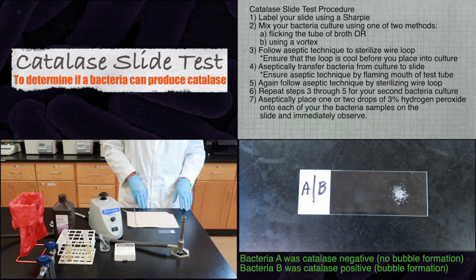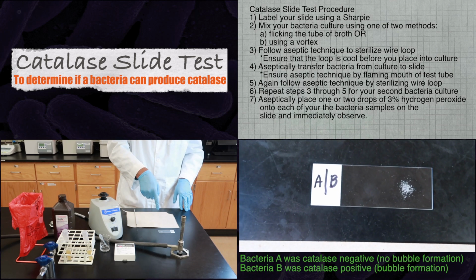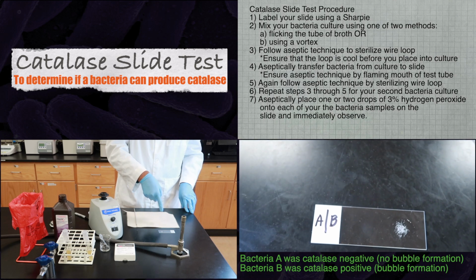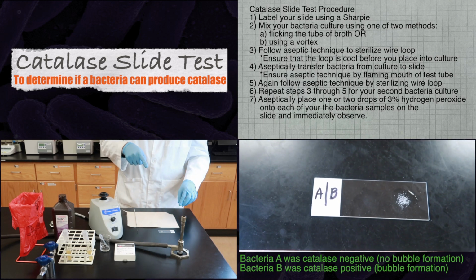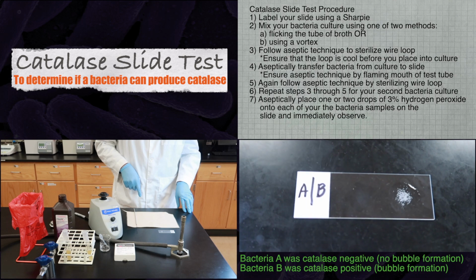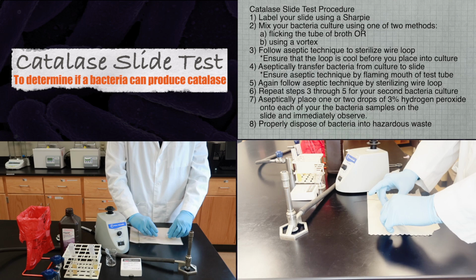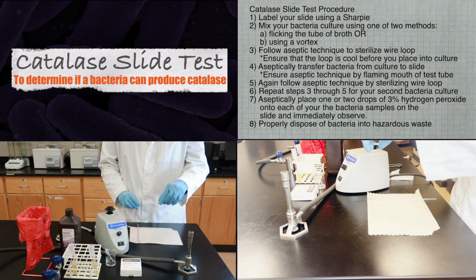In this example, bacteria A on the left was catalase negative because there was no bubble formation, while bacteria B on the right was catalase positive, which you note through the bubble formation. Finally, please properly dispose of bacteria into the hazardous waste container.